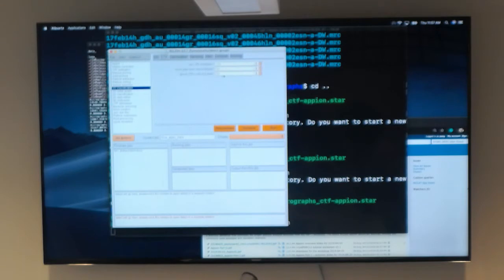Start a 2D classification, and we'll see how long it takes. But Ed, yes. The number of box files and number of micrographs are not the same, right? Right. We have more micrographs. What we did is CTF estimation on the full set, but we hid some images.